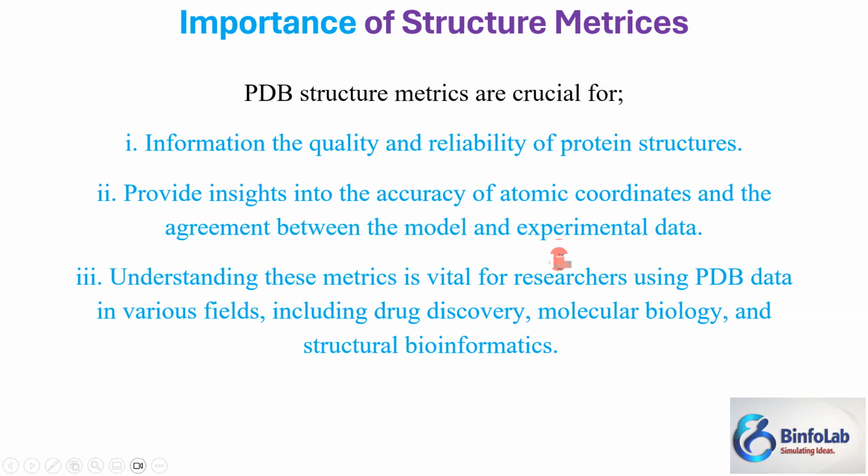So it is shot by the XRD machine with X-rays. Then the synchrotron people will provide them some data. The data will be the electron density data. We call it the electron density map.